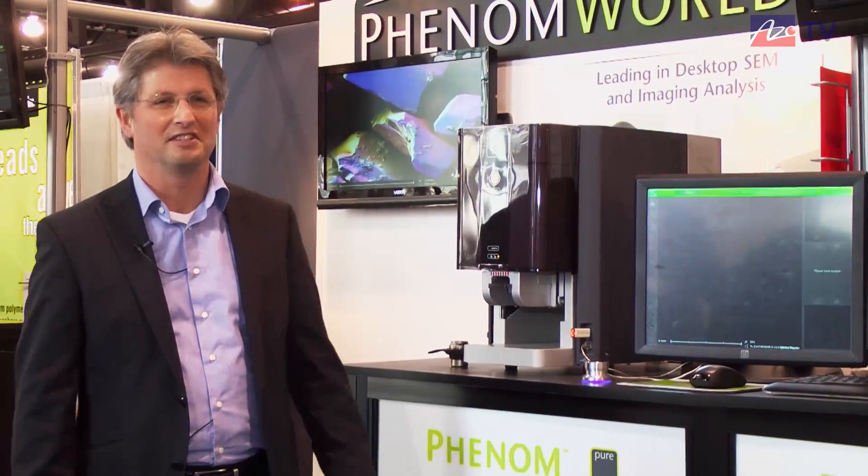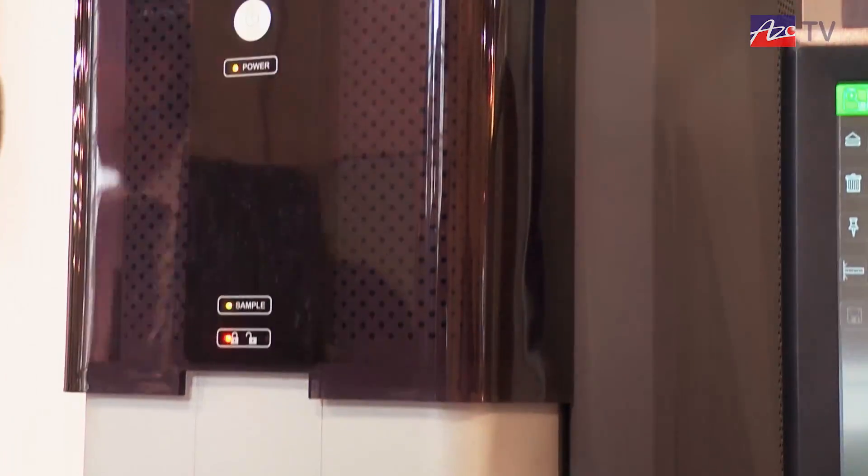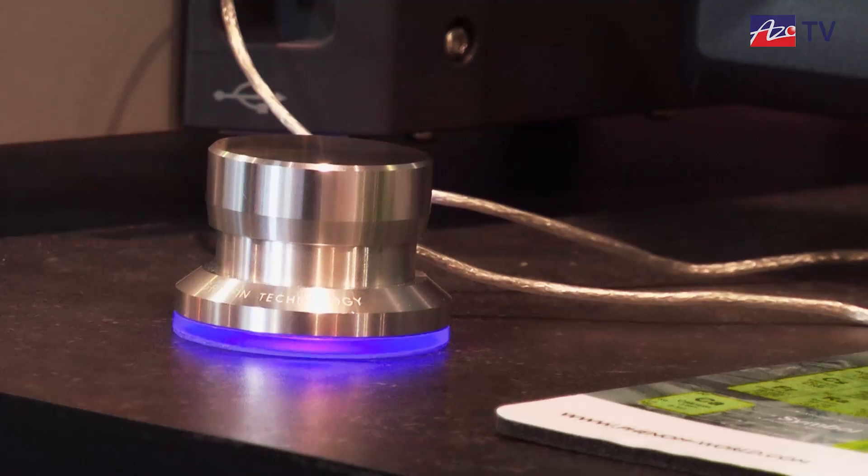My name is Emil Asselbers and I'm excited to talk to you about the Phenom and what it can do for you. It's been designed with the user in mind, aimed at people who are not experts but who have to be able to get results all the time. Our office is in Eindhoven in the Netherlands, which is also where all the innovation from FEI comes from — a big knowledge base for optics and high-tech that we use for our innovations.